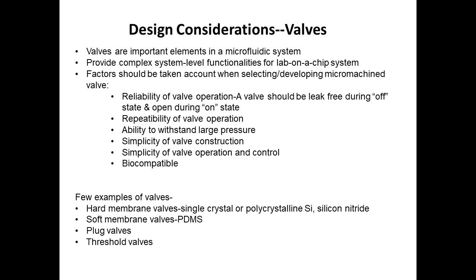A valve should be leak free during off state and open during on state. Repeatability of valve operation, ability to withstand large pressure, simplicity of valve construction, simplicity of valve operation and control, and for our case it should be biocompatible.